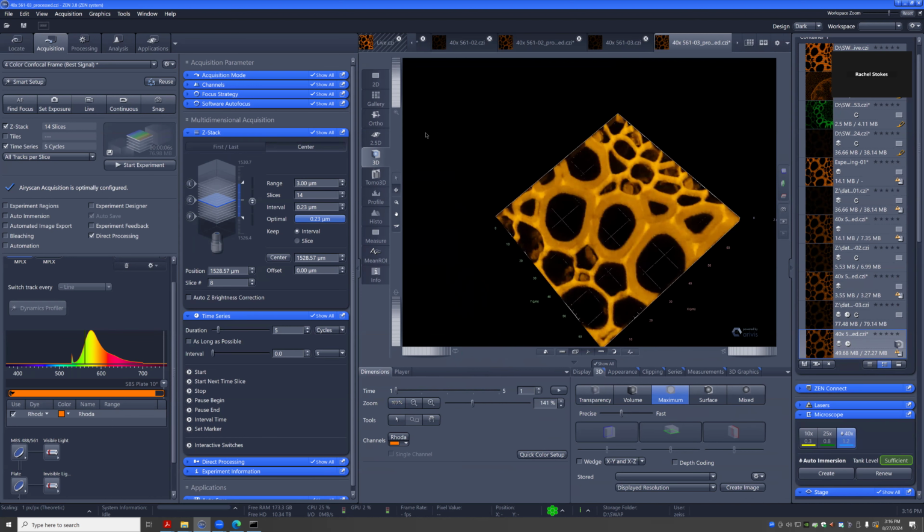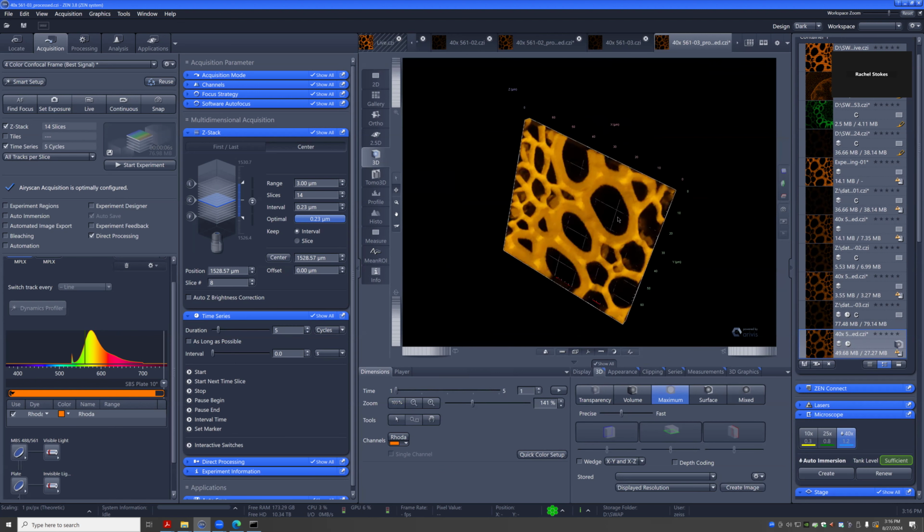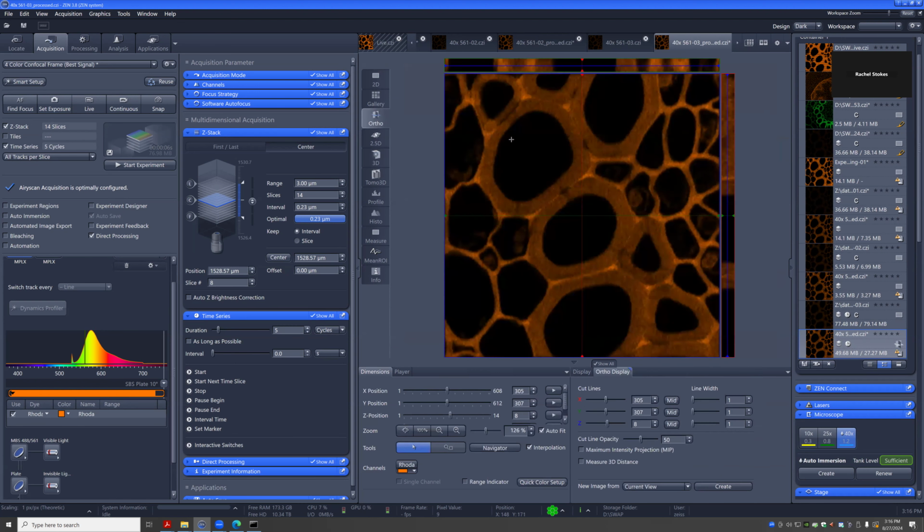So all of these tabs here, they're all contextual. Depending on what kind of data you took, right? If you took a Z stack, you'll get 3D tabs because it'll let you show what this looks like in 3D. This will just give you a basic render. You can do ortho view, so you can see the XZ and YZ planes here. You can move this around and see what exactly this slice looks like. All of that relates specifically to the data that we have.